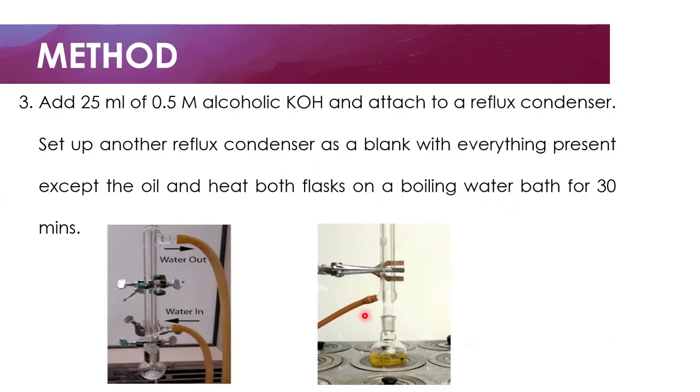So this is the setup for the reflux condenser over here. So this is our water inlet and this is our water outlet, and this is our round bottom flask containing our test sample on a water bath.